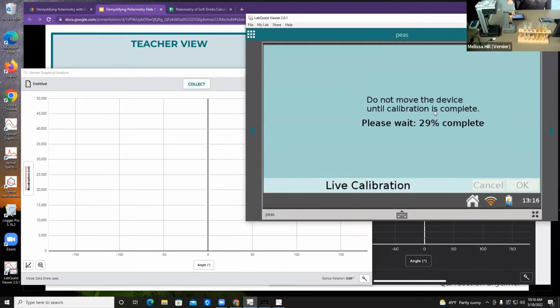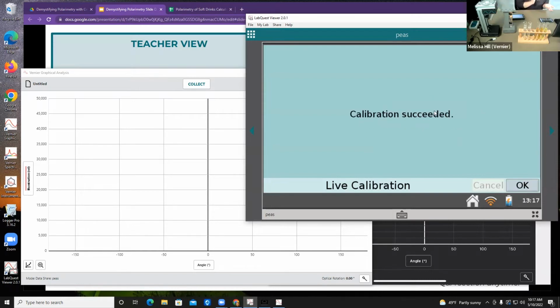So the polarimeter, the fixed polarizers in the base here with the light source, it's going through this sample cell. The sample cell has a ruler on it, which you probably can't see very well, but that's what determines the path length. Most polarimetry is done at 1 decimeter or 10 centimeters. So all my solutions here are to a 10 centimeter height. But if you vary that amount, then you just vary it in Biot's law.